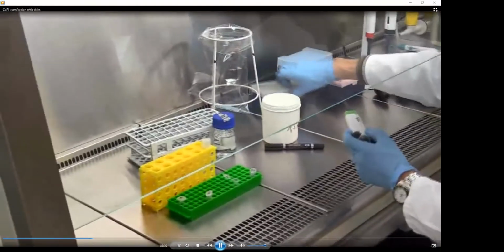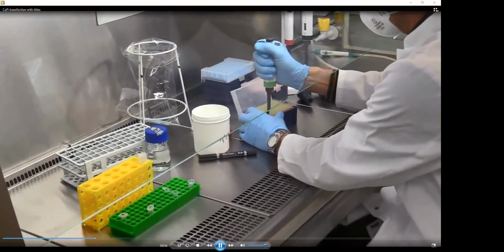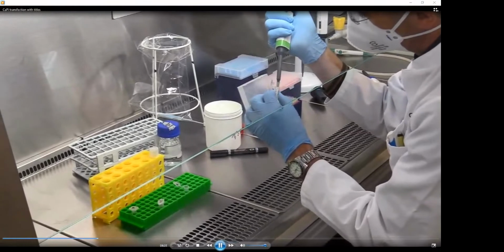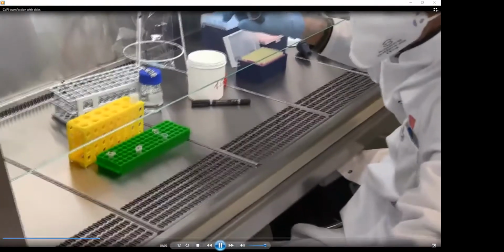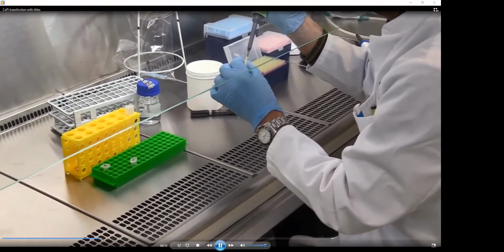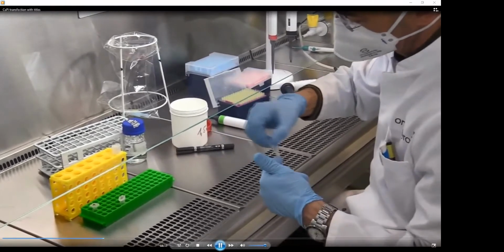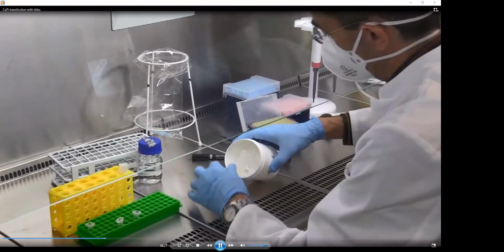Then you have to take the tip, and what we add next is this reporter. We add it to the solution B, mix it properly. This is another step which is necessary to notice, so it has to be properly mixed.